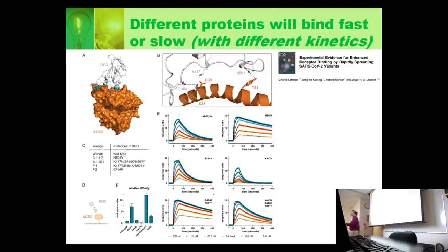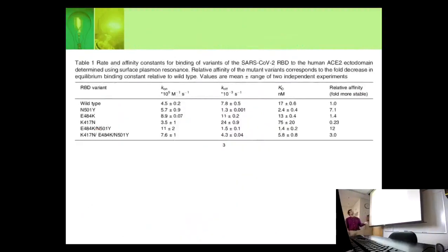And that's all there is to BIAcore. You're really looking at a snapshot of exactly what's going on. And from these, you can calculate what the affinity is. And this is everything that we're doing. They calculate equilibrium constants. They calculate on rates and off rates. So chapter 4, chapter 6 and 7, and we will talk about those as we go through.